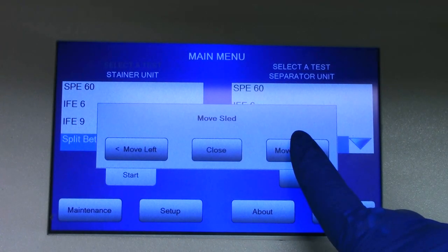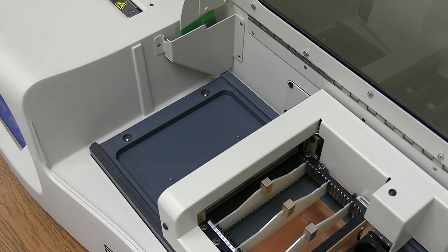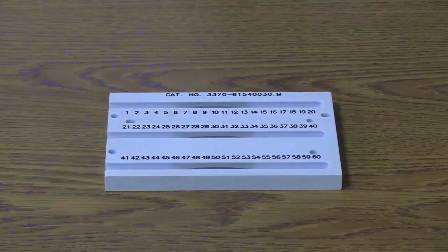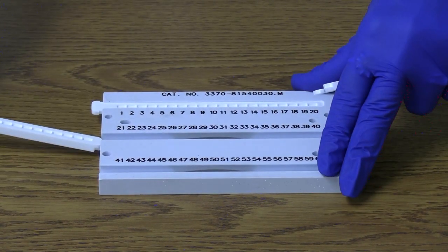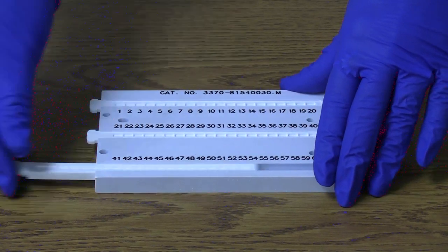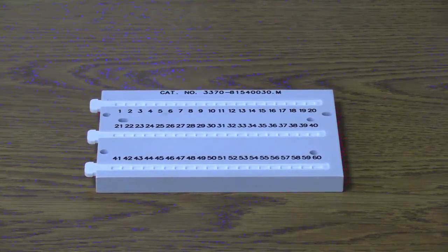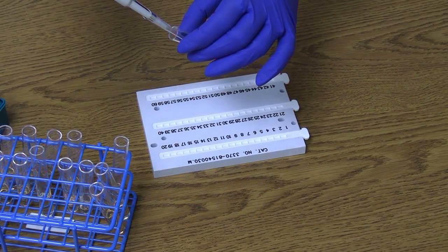Use the touchscreen to move the applicator assembly to the right side of the instrument. Prepare the sample tray by sliding the disposable shallow well sample cup strips into the tray. Pipette samples into the rows of cups that correspond with applicator blade placement. If desired, the sample pipetting process can be automated by the SPIFE Touch.